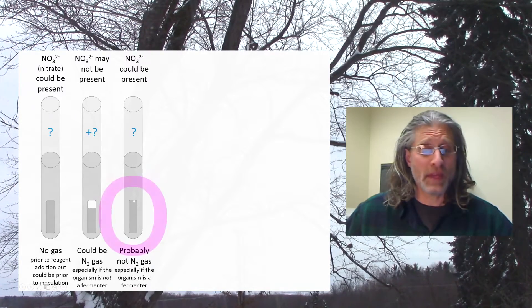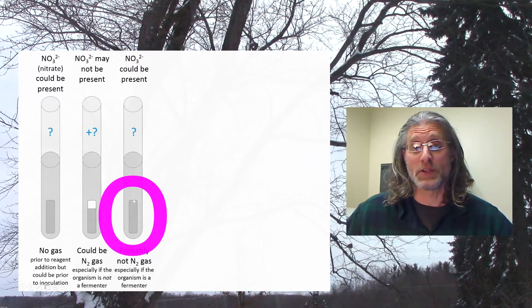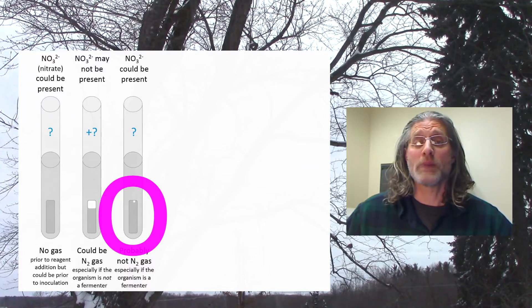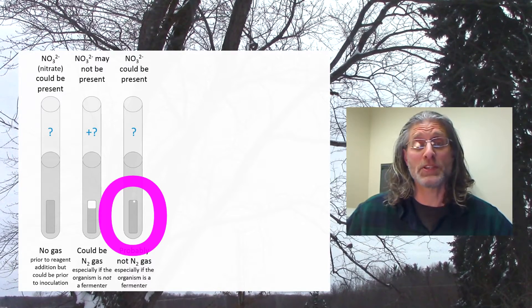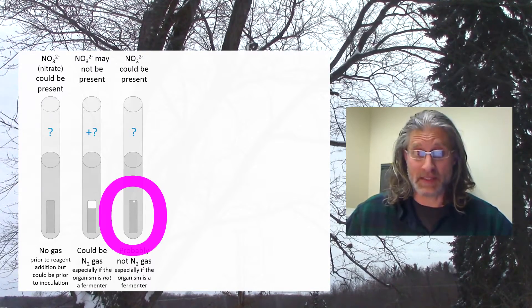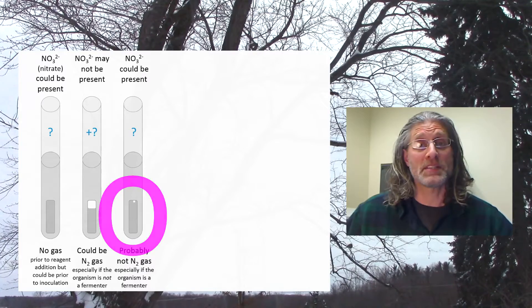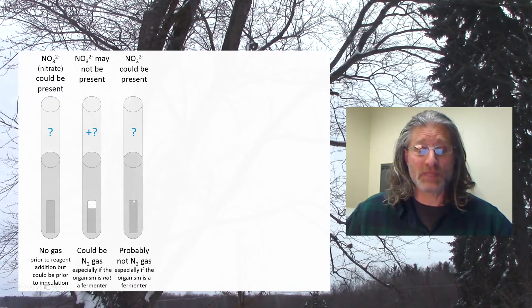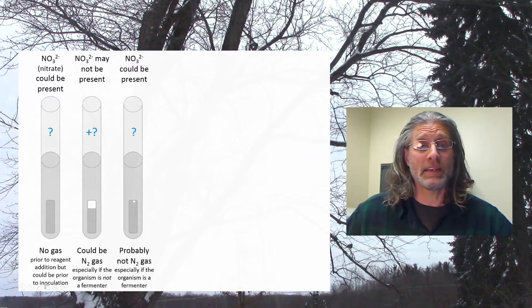Alternatively, you may see a small bubble in the Durham tube. This is not necessarily an indication that nitrogen gas has collected. The presence of the bubble may be inadvertent, somehow left over from the preparation of the medium, or it may be that the organism is a fermenter and the bubble represents a fermentative product. In any case, the presence of a small bubble is not indicative that nitrate has been reduced.